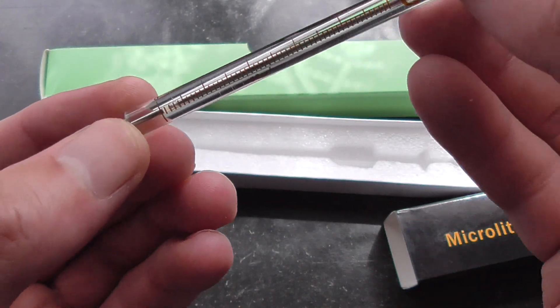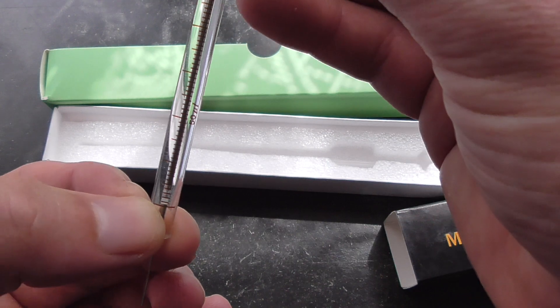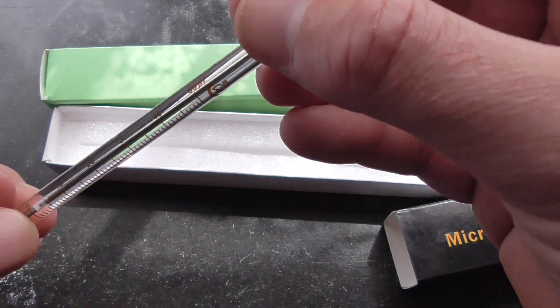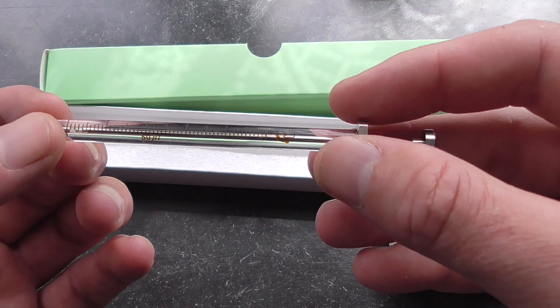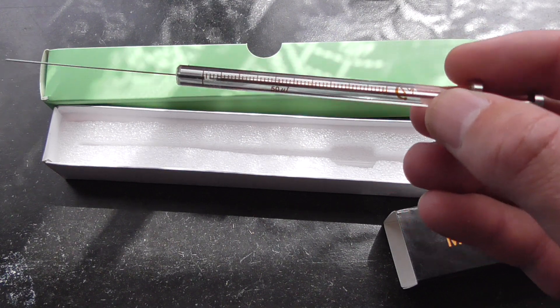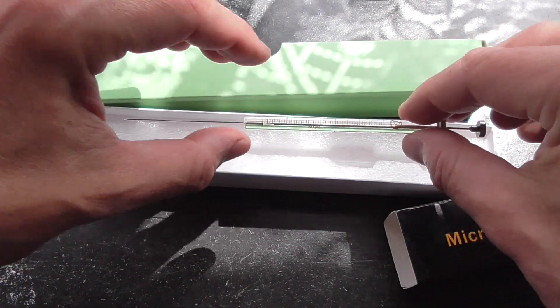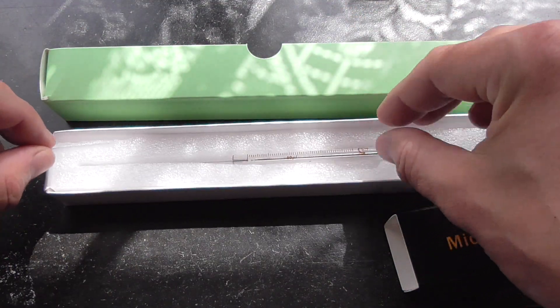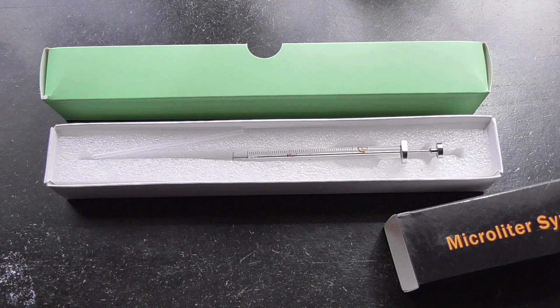It has a graduation where the lines are in 1 microliter steps and it goes up to 50. There are different sizes — even smaller ones or bigger ones; I think they go down to 0.1 microliters, which is extremely small. And of course there are much bigger ones, but for this purpose this one was quite useful. It cost a couple of bucks, but it's worth the price.